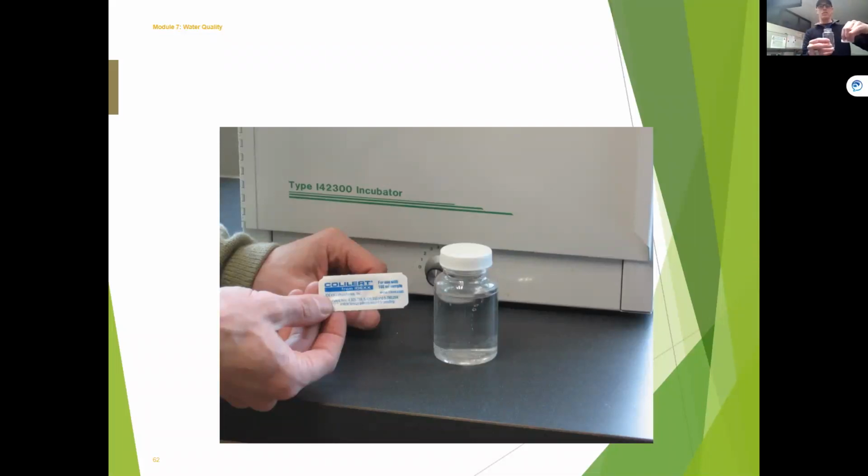And then once it's full, I actually just set the cap back on there. If I'm doing an in-house sample, I'm going to put my own bug food. Remember those pink trays of bacteriological? We're going to see them again coming up here. Now inside here, there's some bug food, and it does the same thing as that pink agar solution that we saw earlier. And we put this into the bottle, again keeping your fingers off the critical areas.